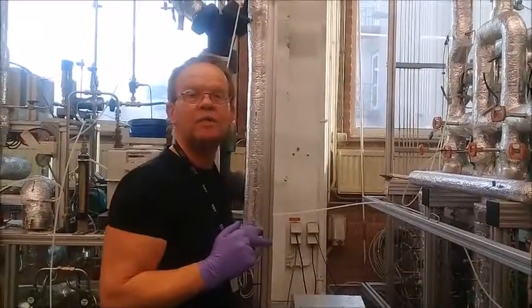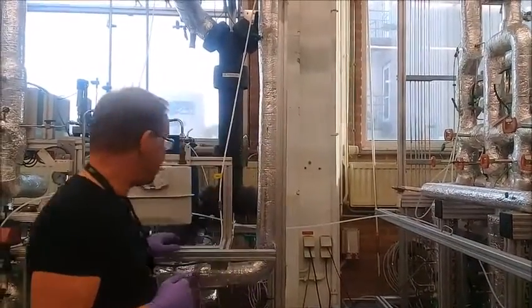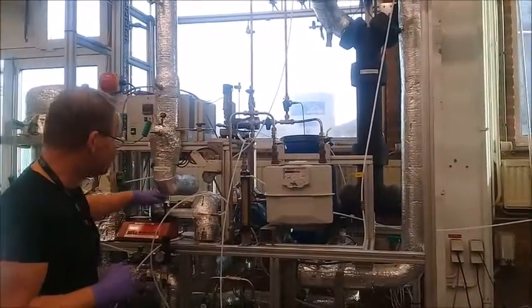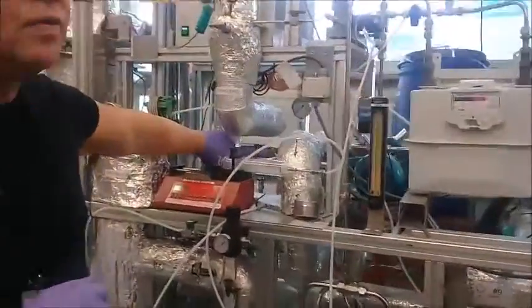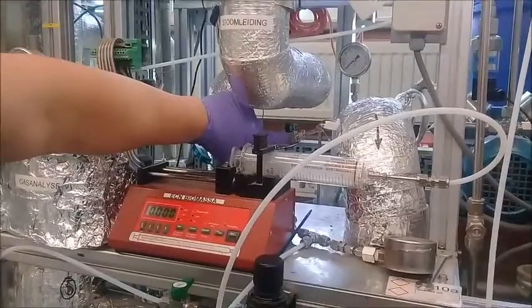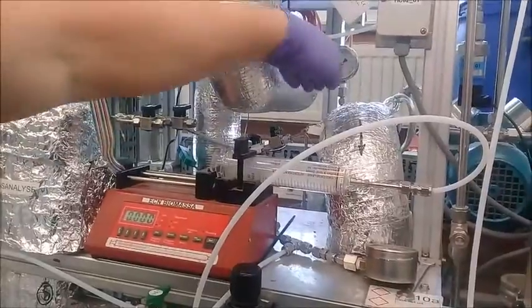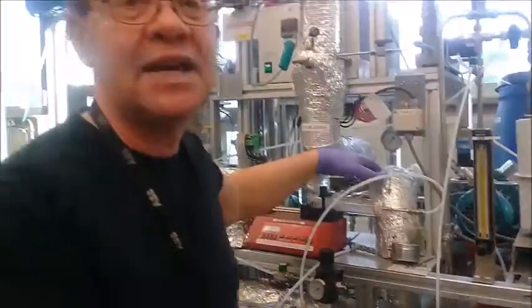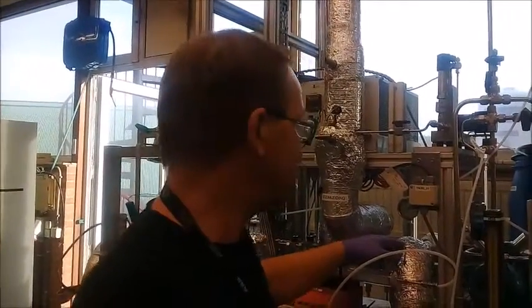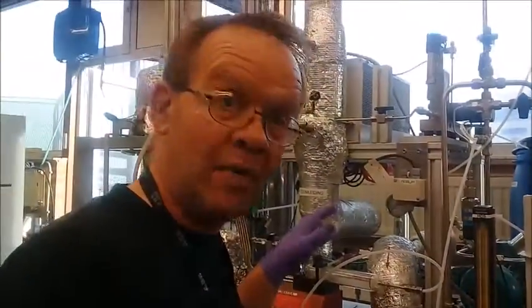So this is the sampling site where we want to sample the gas for the guideline sampling, and we will do that normally from sampling points like this one. That's just containing a normal Nupro valve, and we can open it before we start with the gas sampling through the bottles. So this is connected to the system, and the gas we are going to measure in this position is the gas coming from our BTX unit. And that's the unit that is extracting the benzene and the toluene and the xylene from the process. So on this sampling point we're going to concentrate all the compounds coming from that process.